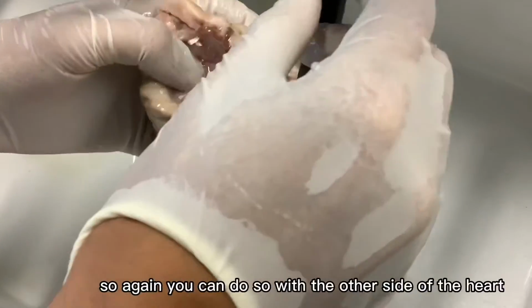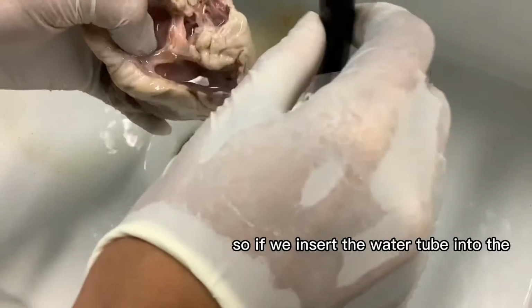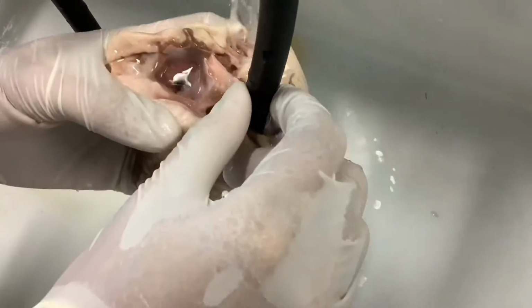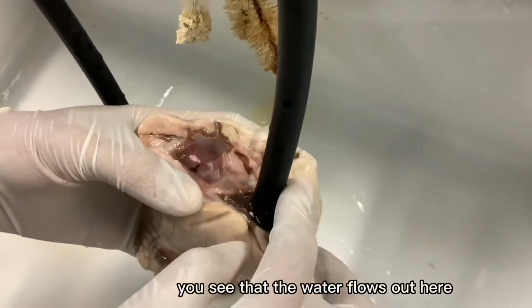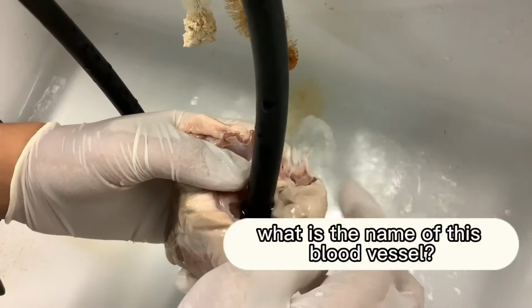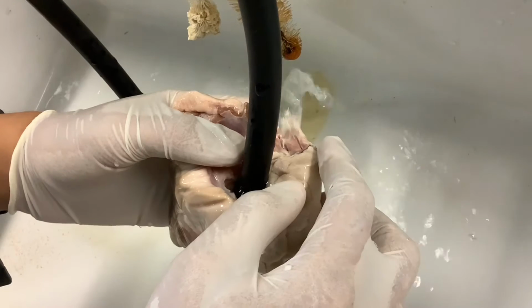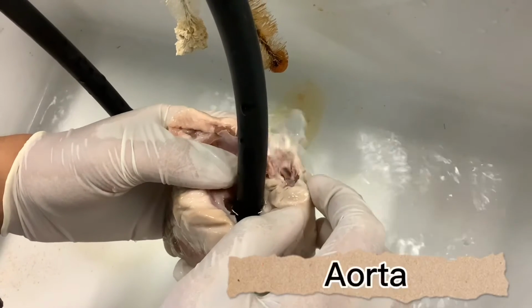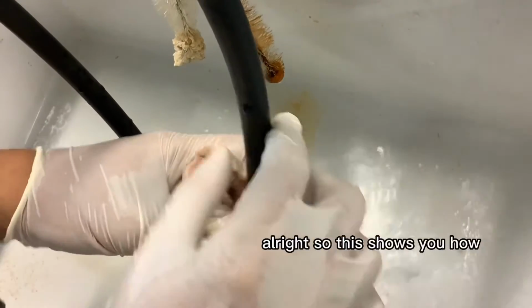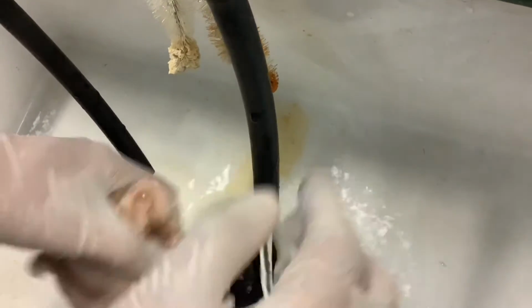Okay, so again, you can do so with the other side of the heart. Here's the left side of the heart. So if we insert the water tube into the pulmonary vein, what you see is that the water flows out here. What is the name of this blood vessel? Right. If you answered that it is the aorta, you are absolutely correct. Alright? So this shows you how water and blood flows through the heart.